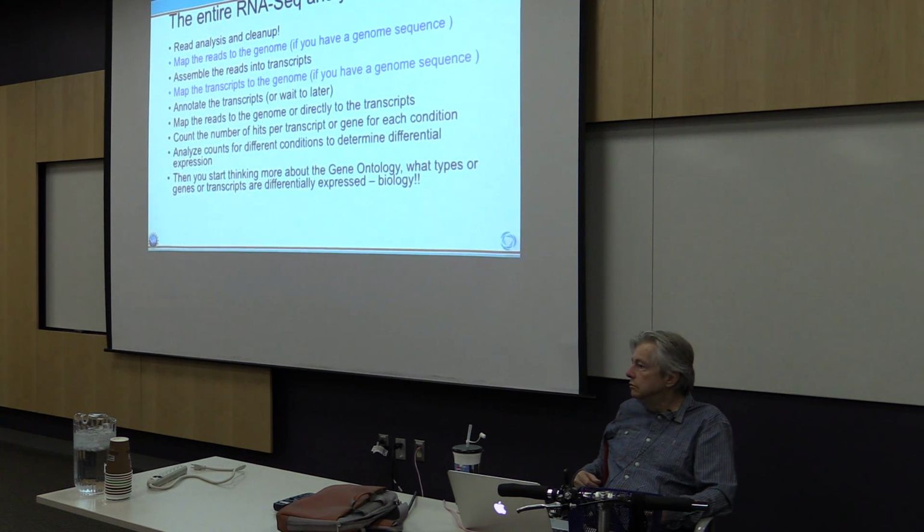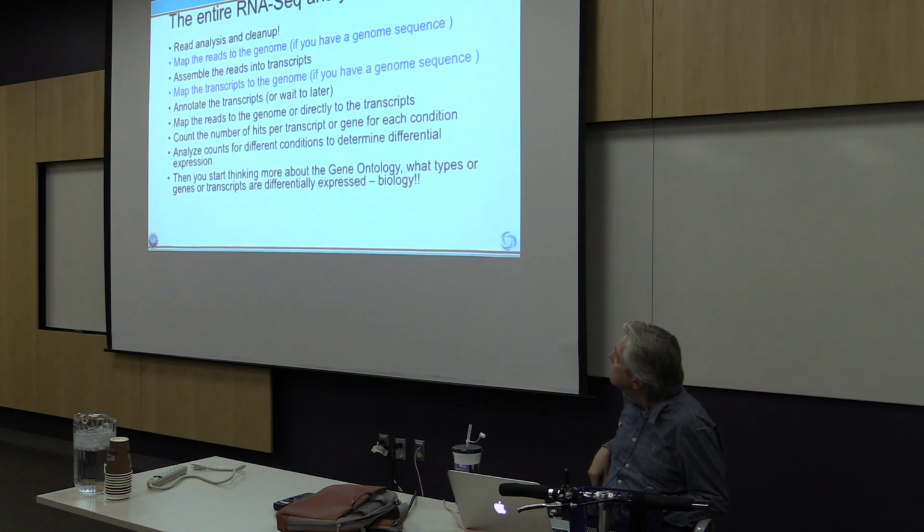So one of the key things to understand with the method that we're using today, the Tuxedo method, Tuxedo because it uses Bowtie, TopHat, Cufflinks, and then the oddly named Cuffdiff.